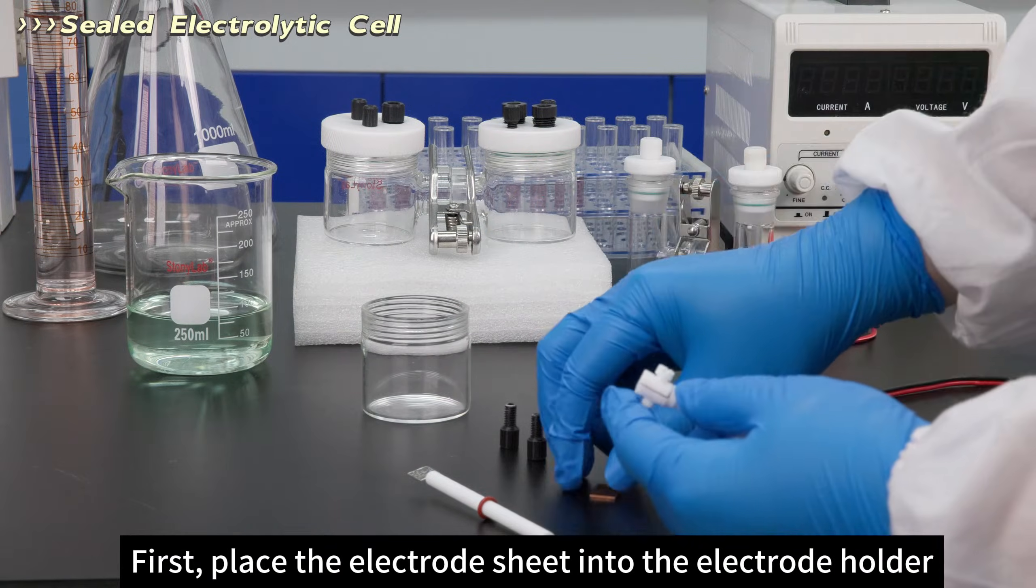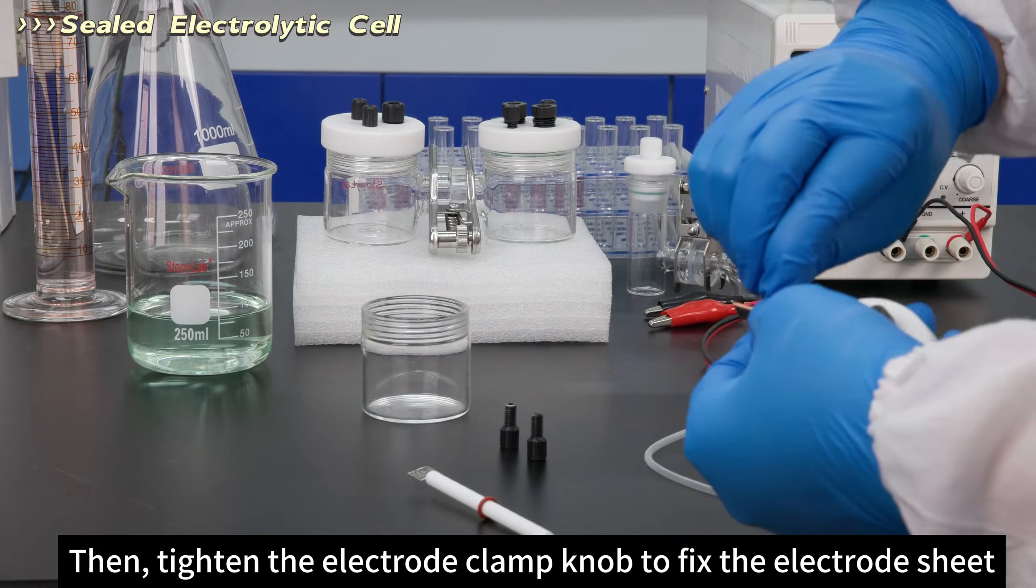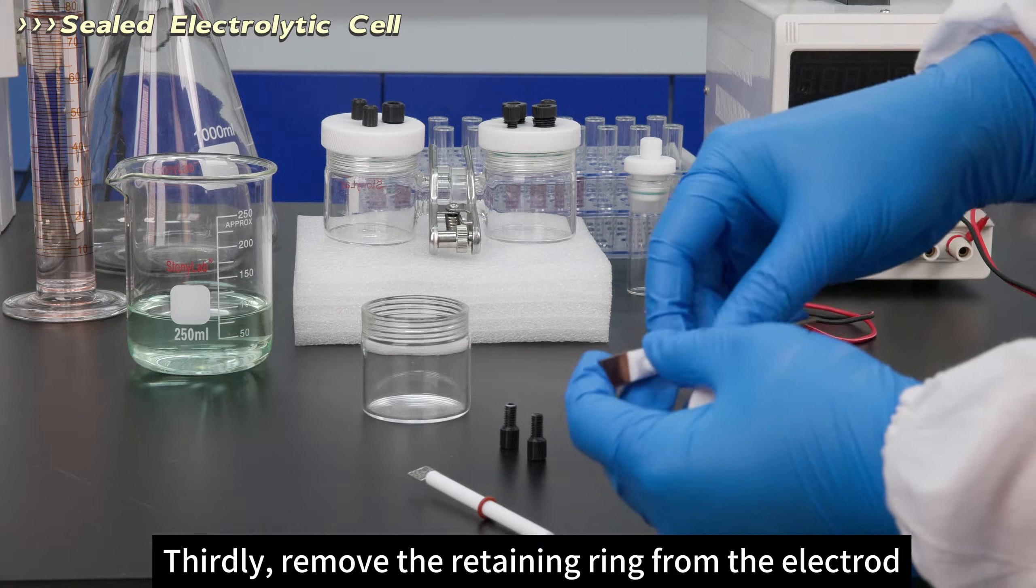Place the electrode sheet into the electrode holder, then tighten the electrode clamp knob to fix the electrode sheet.